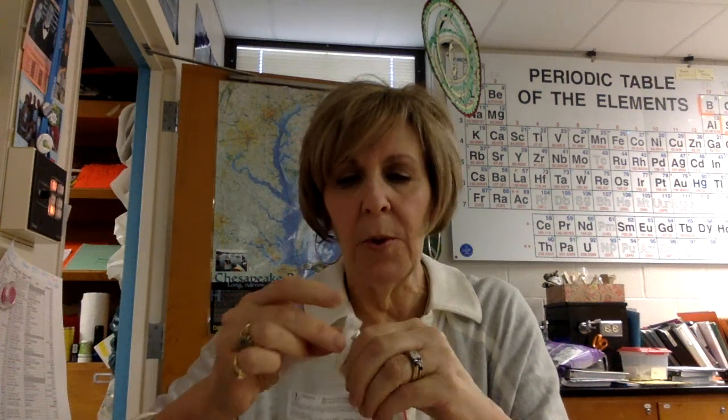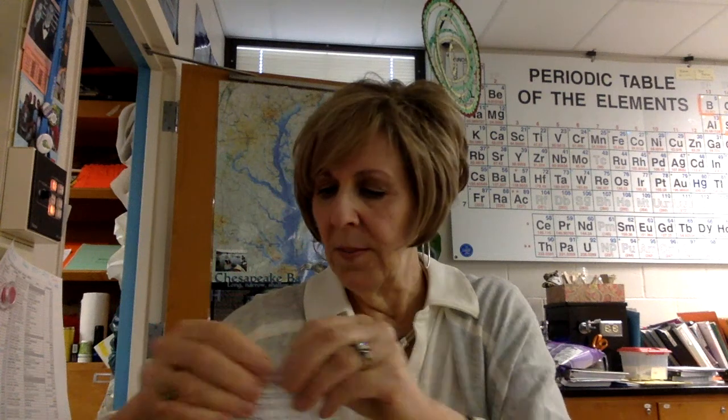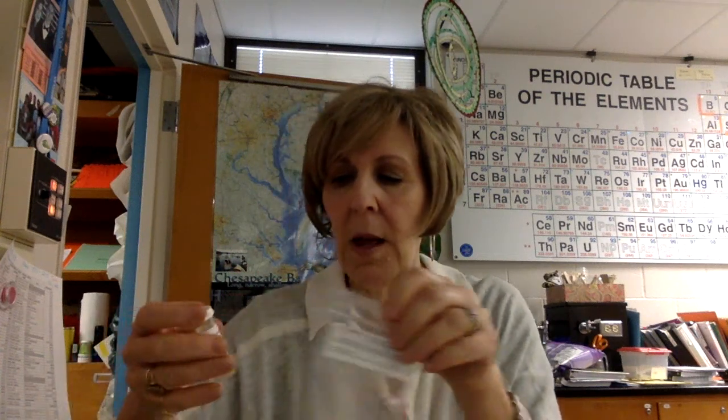So at the end of the activity, you're going to put everything back. You may throw away your swabs, and then you need to put the samples back. Make sure the lid is on so it's not leaking out sample, this little push cap. Put the lid back on, and then you're going to put the little pipettes that go with each of the 4 samples away.